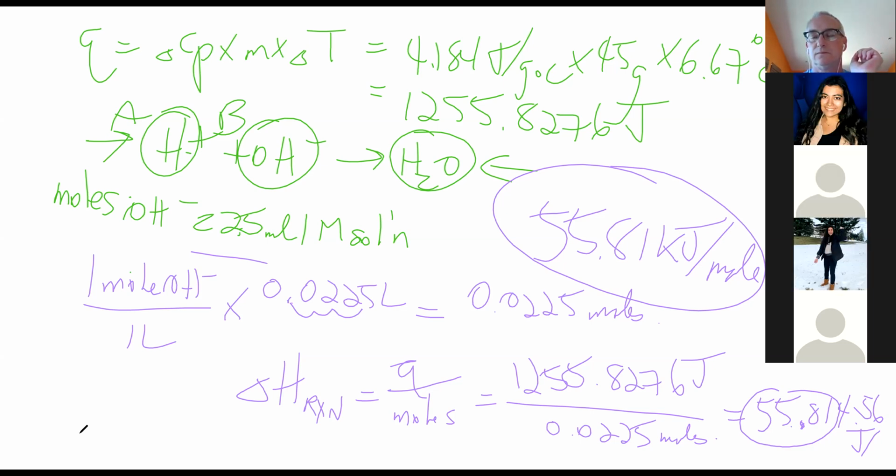For reaction one, I noticed that you put 0.9 grams of NaOH instead of 1. I just wanted to understand your reasoning for that. Oh, just because it said add around 1. So the instructions were to add around 1, so I added around 1. Would it be okay if we did exactly 1? Yeah, it's fine. Okay, thank you. Yeah, you could add more than that if you want.